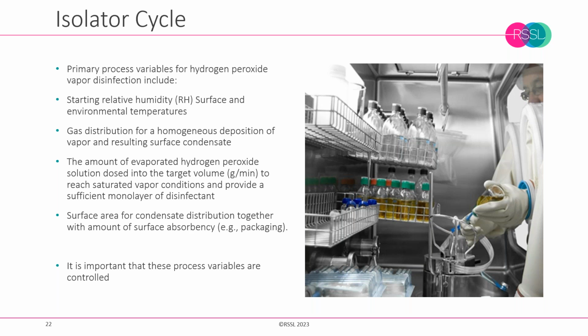And the issue here is that if they then have a slow release process, this can increase the aeration time. So we can complete our kill roughly the same based on the mass and dimensions of materials, but our ability to get to the occupationally safe exposure level will also depend upon the nature of the materials and their absorbency. So if they are slowly releasing peroxide, it may take longer to aerate, so that's something else to consider.